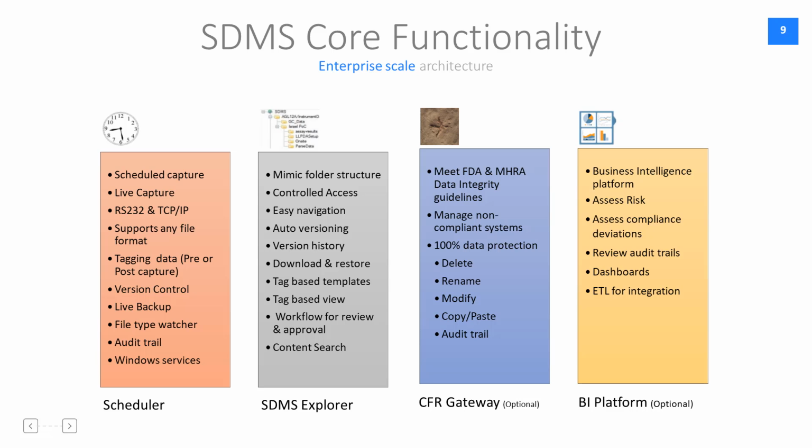SDMS Explorer is one of the most used functionality by end users. This area is similar to a Windows Explorer. So anybody who uses Windows will be able to appreciate using the SDMS Explorer. SDMS Explorer will display the file content inside the SDMS server.